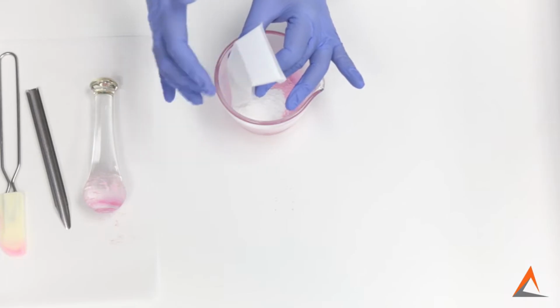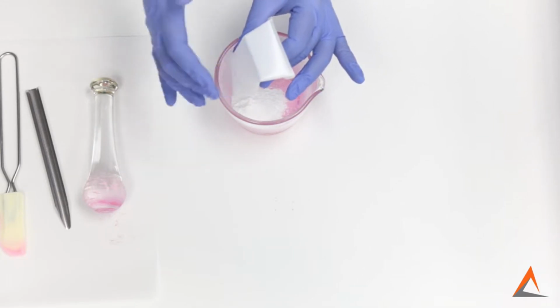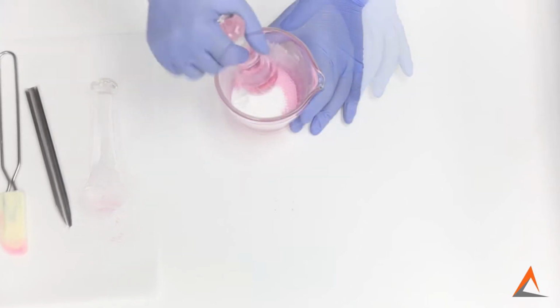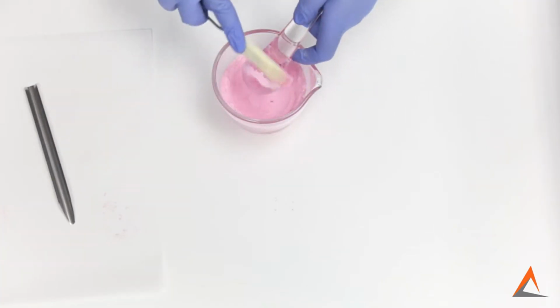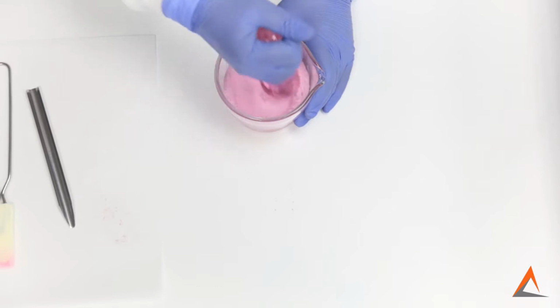To help get all the powder out of our weigh boats, you can also go ahead and just flick the back to expel any remaining powder from the weigh boat. Once again, go ahead and triturate. After we've mixed, let's scrape down the pestle and mortar and mix one last time to ensure all our powders are thoroughly mixed.